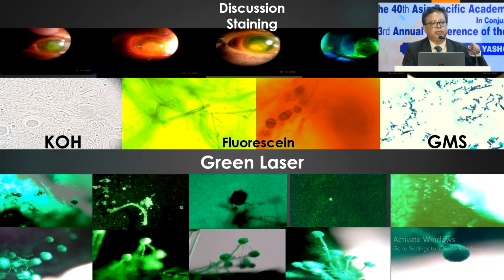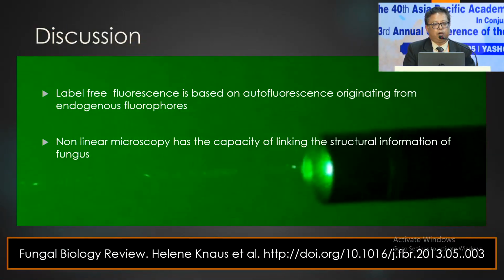Now we see in this clinical picture, KOH was done immediately on the scraping, and in our lab we have done fluorescein stain in those cases, and GMS stain, if you see, was done in the permanent section. All this with green laser was seen in our microscope.